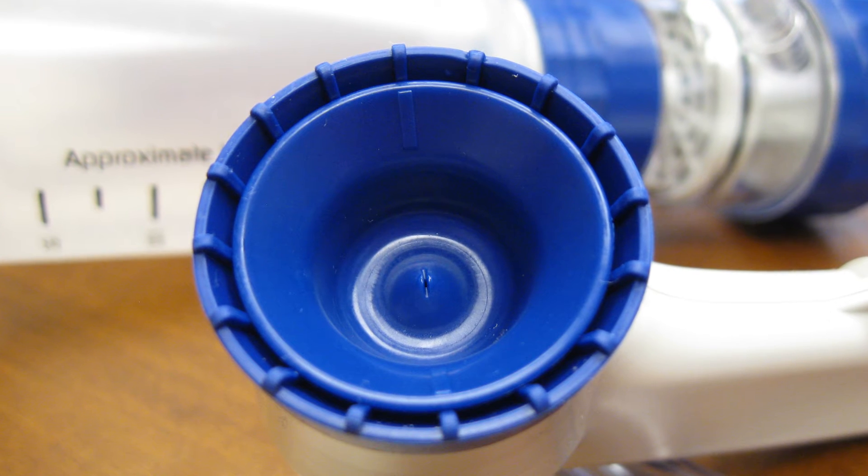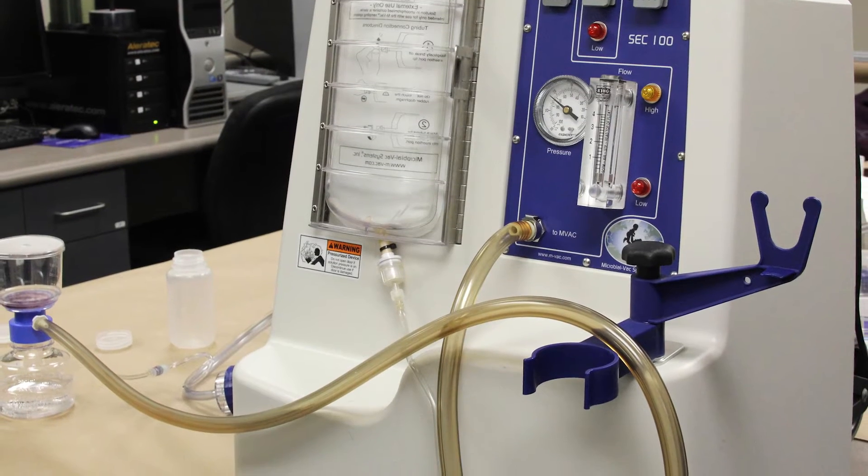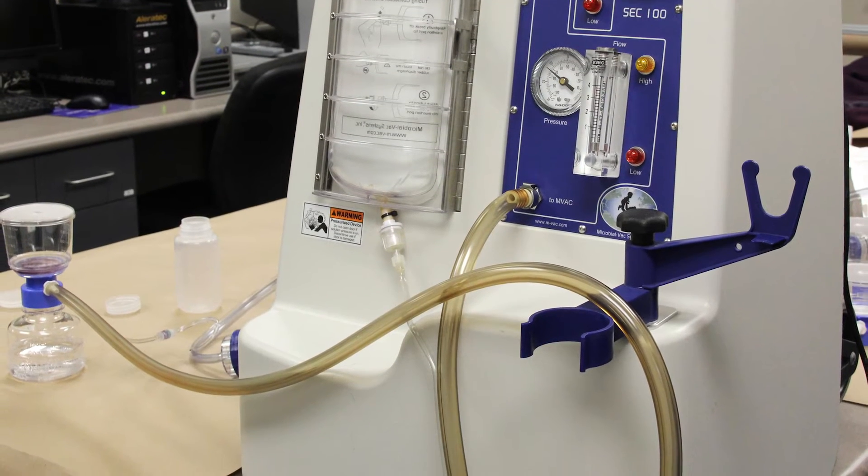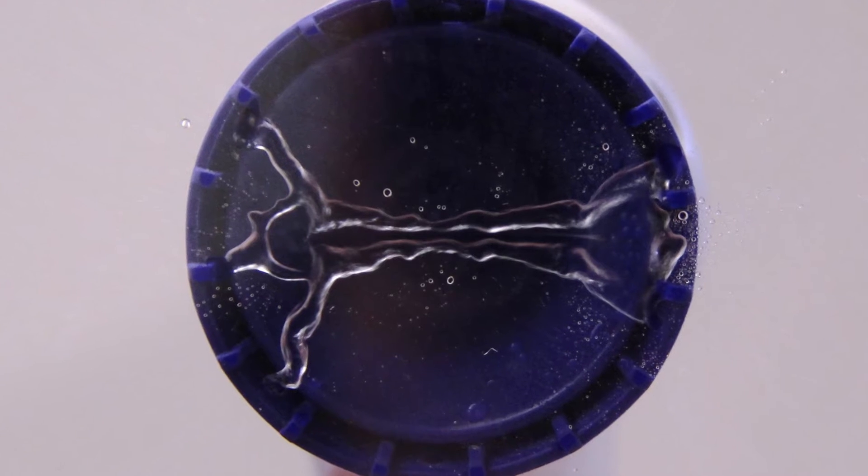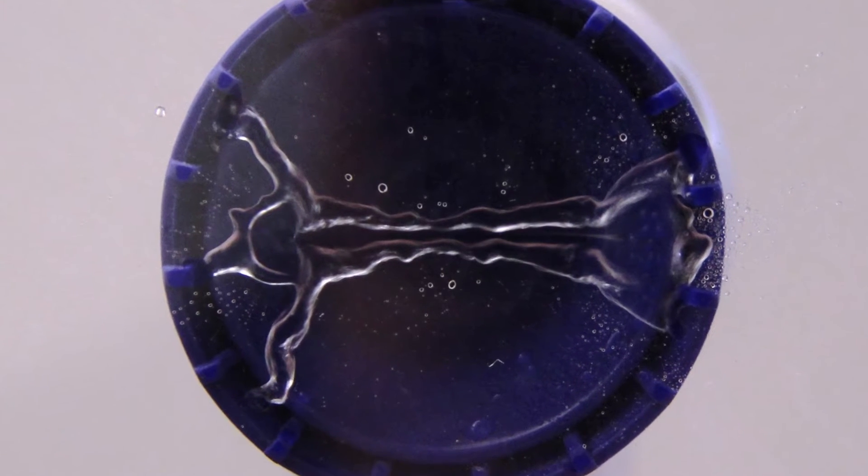And the MVAC, in lieu of that, is a vacuum system. So it's applying solution and vacuuming at the same time. That action creates turbulence on the surface, and that turbulence picks up the DNA material.